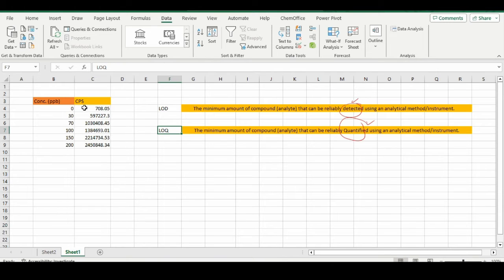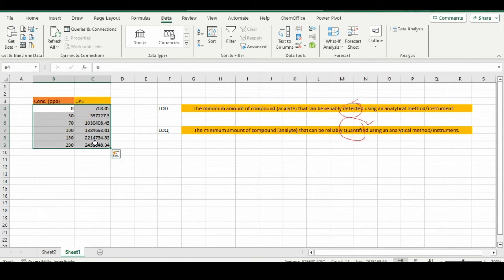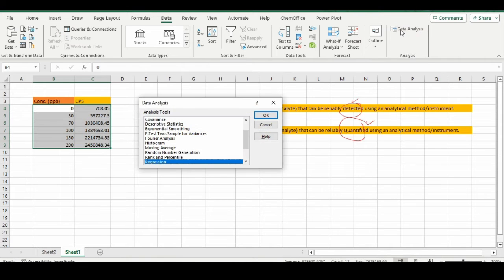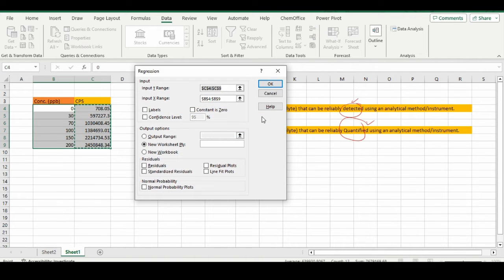In order to find out the regression, first we need to select the data. From the tabs, under Data, you need to select Data Analysis, and from Data Analysis you need to select Regression.